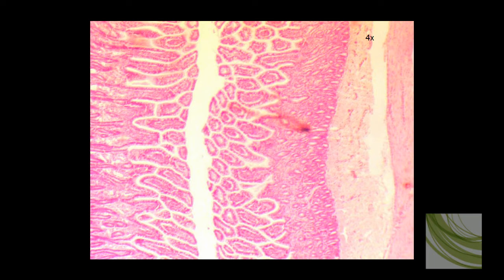Now in this magnification, we can see, besides the little layers of simple columnar, some other tissues. Here's some smooth muscle, and you want to focus away from those. Remember, you're always going to find epithelial tissues on the edge of something. This space is called a lumen.